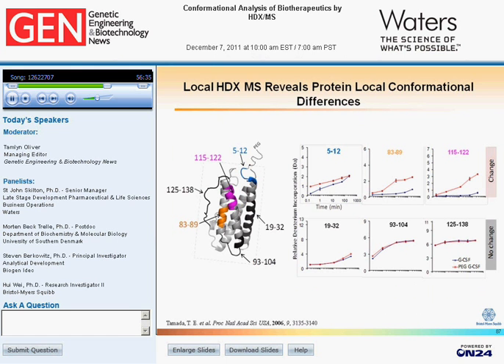But many more peptides did not show a significant difference between the two proteins, and many of them are peptides in the loop regions, such as peptide 93 to 104 and 125 to 138. There's a peptide which is 19 to 32. It is a long peptide in the alpha helix region, and this peptide has multiple residues that are involved in the receptor binding. And for this peptide, we did not observe any difference between the two proteins. And the result indicates that although we do observe obvious difference between the two samples, these differences may not have an impact on the protein's biologic activity. Next slide.